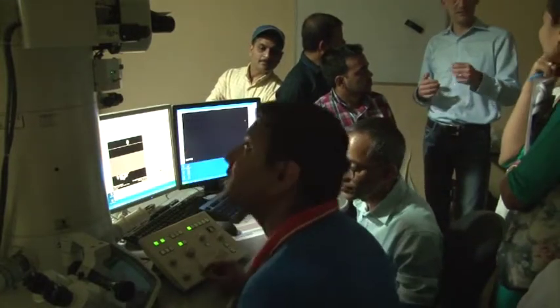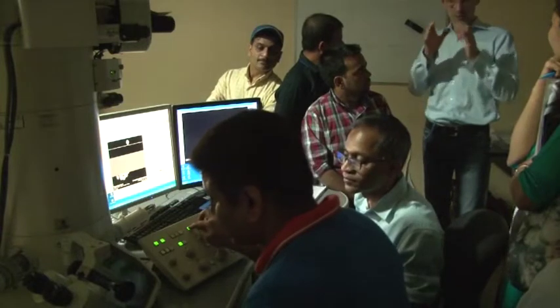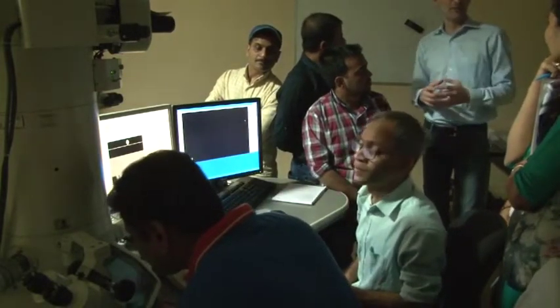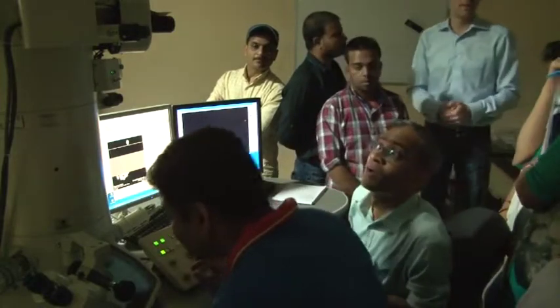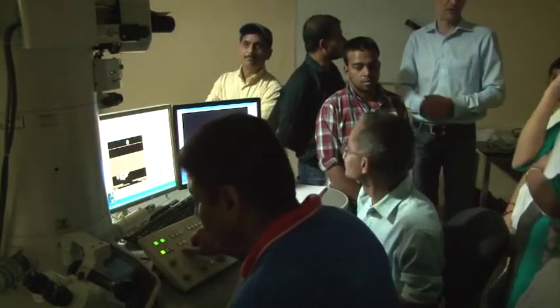And if you go to a very slight overfocus of a few nanometers, then your atomic columns are bright, your boundaries are atomically sharp, and your resolution is at 50 picometers instead of like 180 picometers. That's very clear. So we have, in principle, 3 advantages of aberration correction.